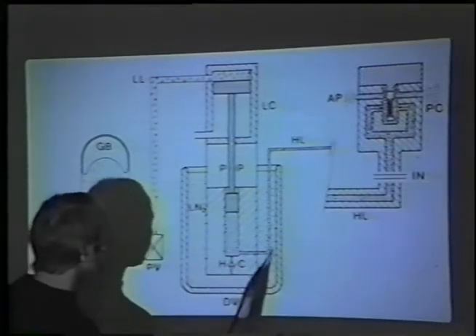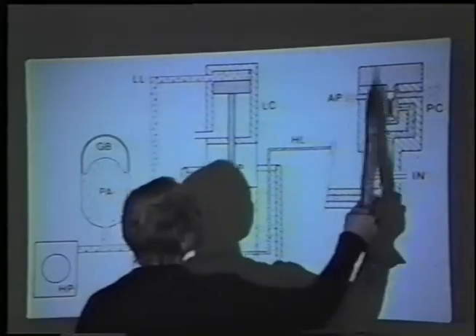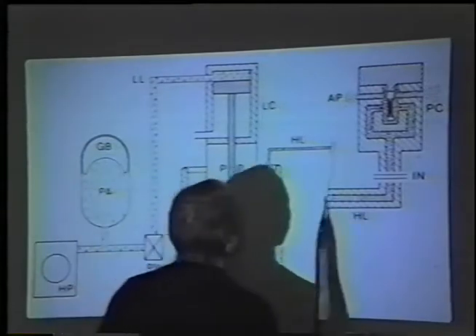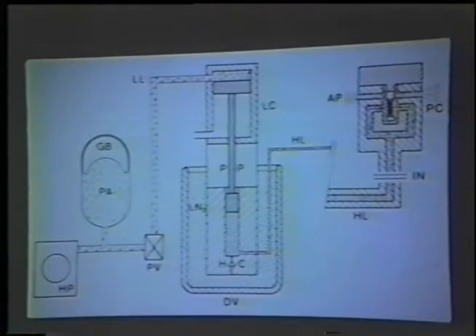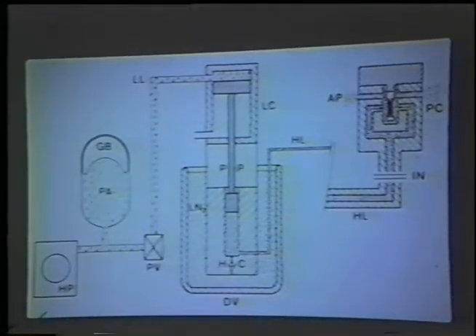The liquid nitrogen is then forced through the high pressure line and into the sample chamber. The sample is held in the sample holder similar to the jet freezer sample holder. It's again sandwiched between two metal specimen carriers. The liquid nitrogen comes in, sprays on the sample, and then exits through two narrow apertures. These apertures are about 400 microns diameter. 100 mils of liquid nitrogen is pushed through those two apertures in half a second. And that's how you generate the pressure in the sample chamber.